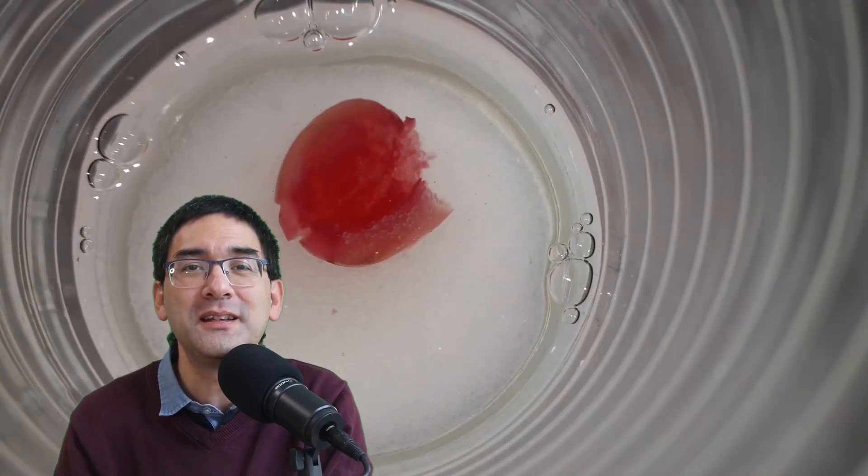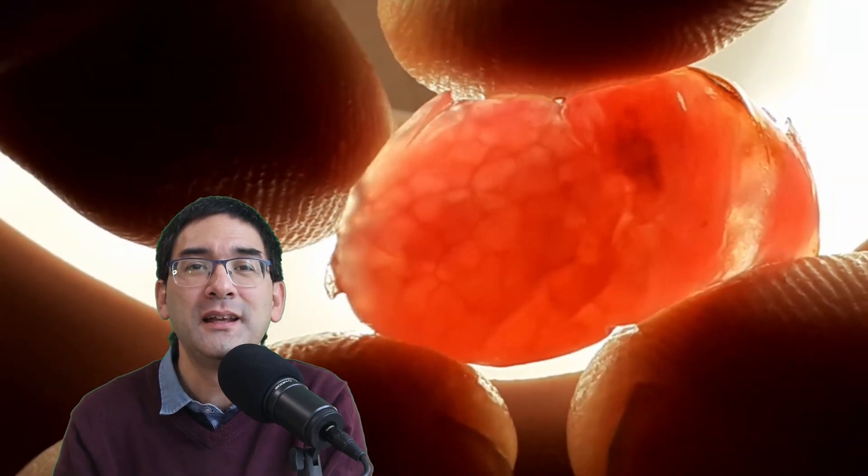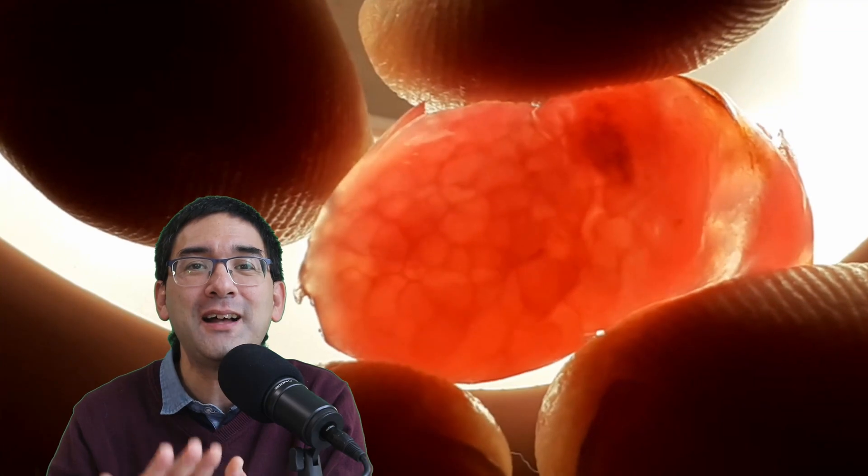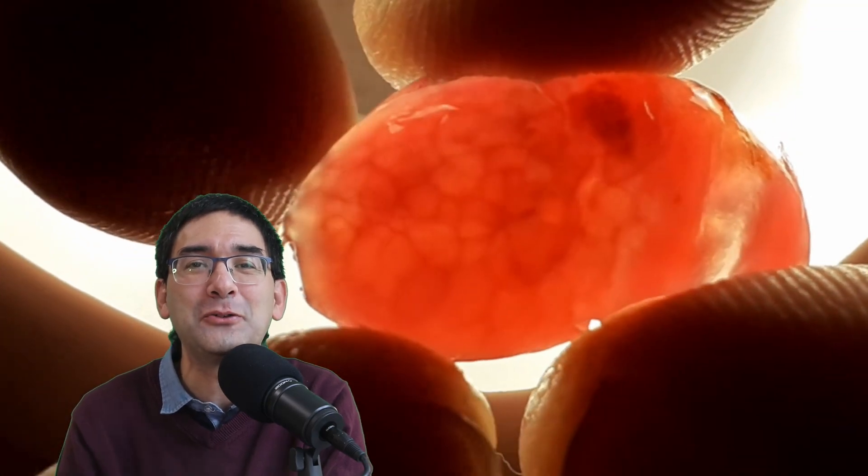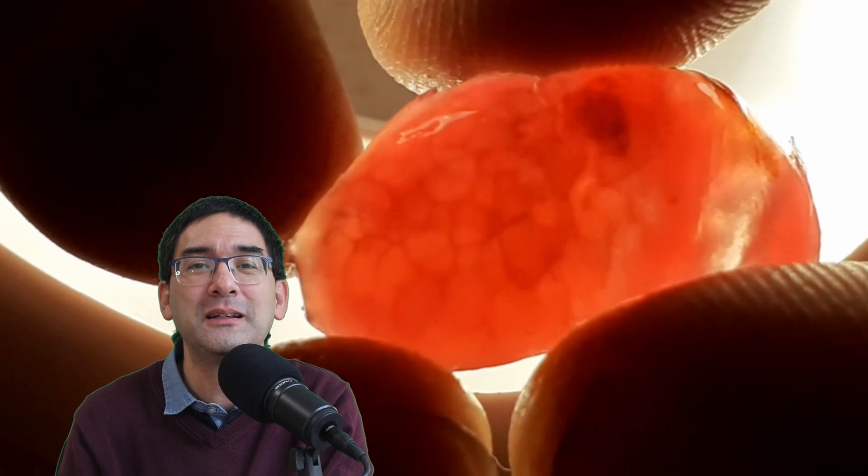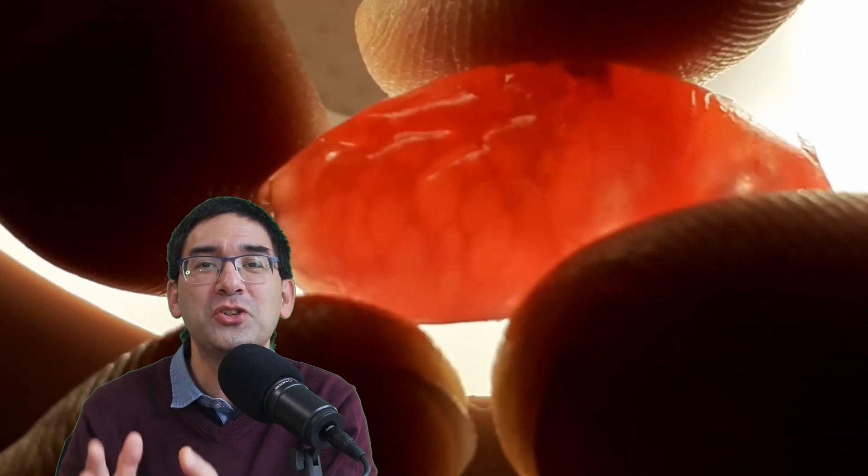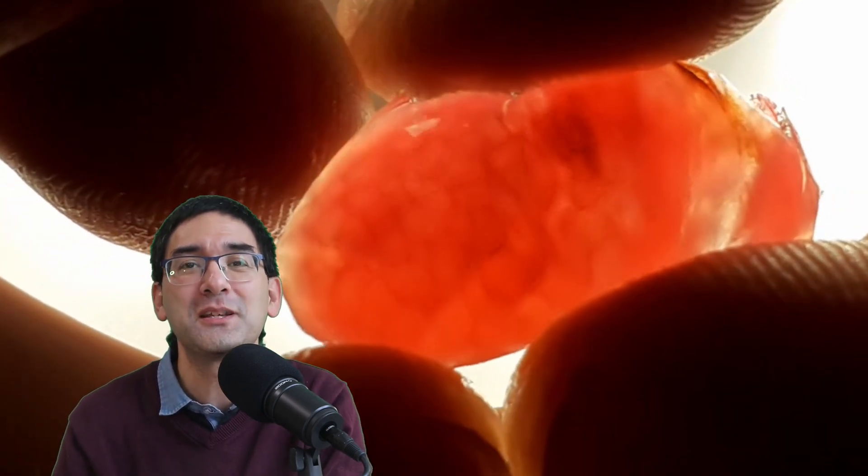And then I found the following. Look at this, behind this a very bright light, I was actually able to see now the vascular tissue. So it did become a little bit transparent as well and it almost looks like a little bit like the blood vessels, but of course these are the structures where water is transported in the fruit.